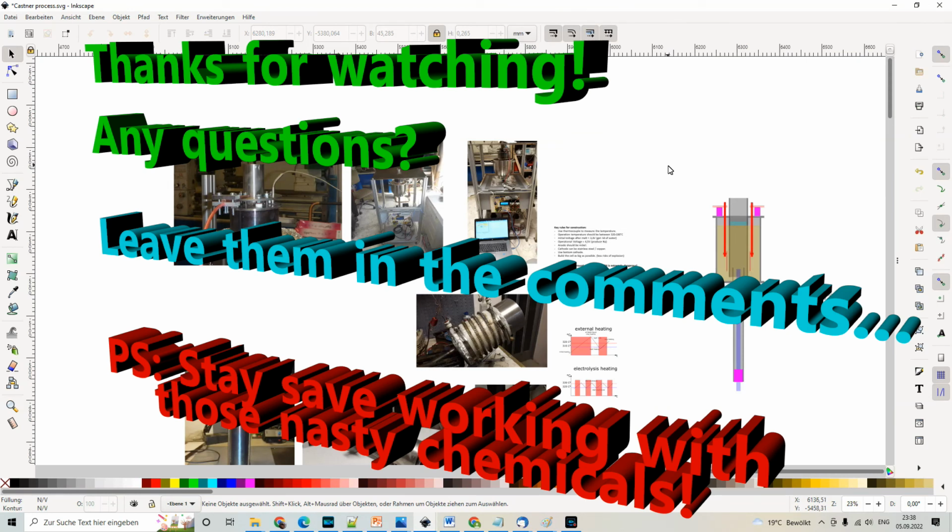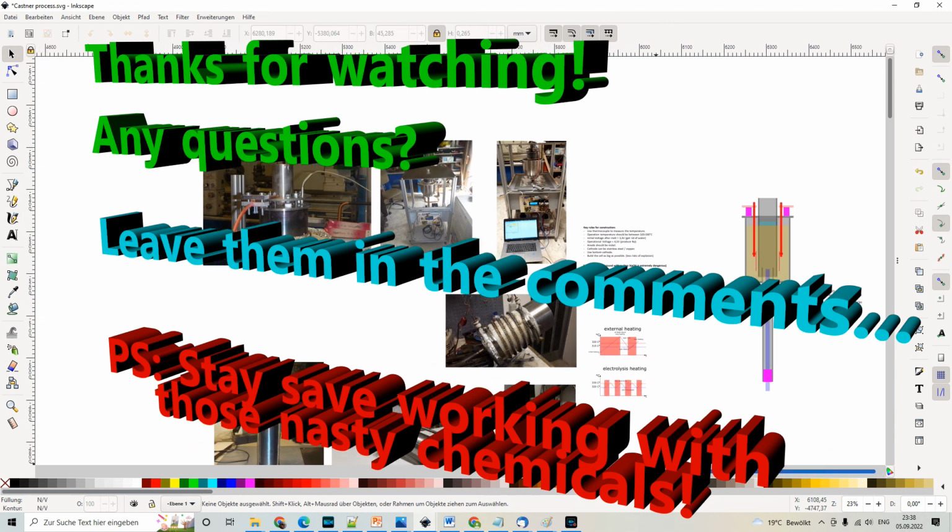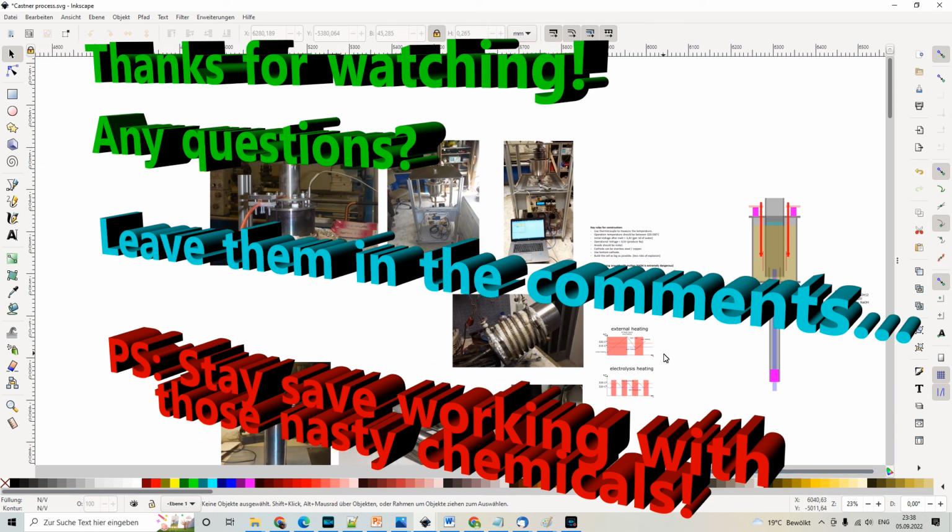Just some final words about safety in the end. It's very likely that at some point, no matter how well it is designed and how good the concept and everything is, there will be some explosions and some accidents. So it's a very good idea actually to invest in safety equipment. I mean, really good safety equipment, not only safety goggles, but really a full body protection when you're going to play around with that stuff, because it's just inherently dangerous to be close to it.